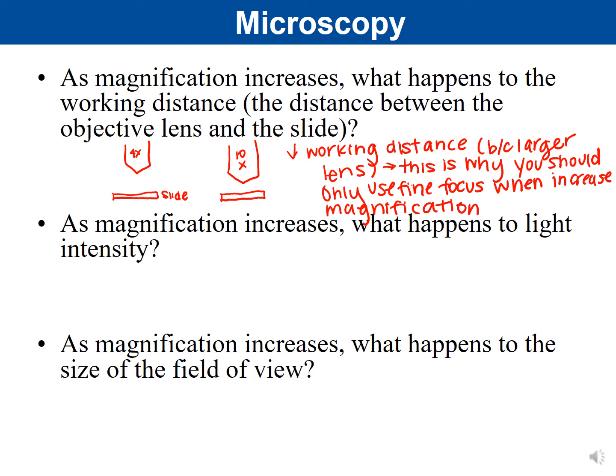So you should only use the fine focus when you increase your magnification, because you'll notice that as your lens gets larger and larger, the distance between the lens and the slide starts to get really close.